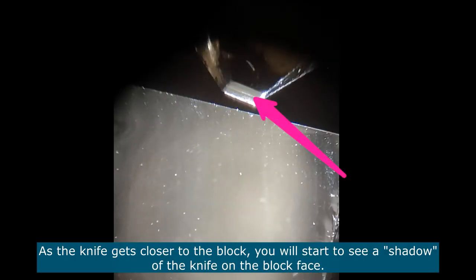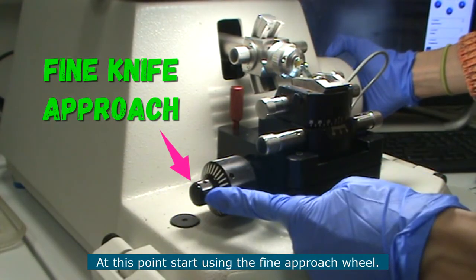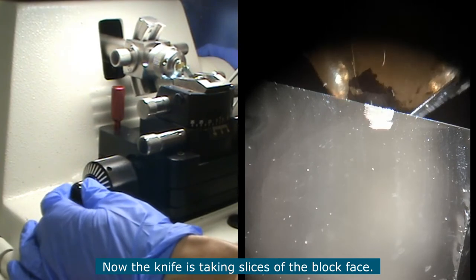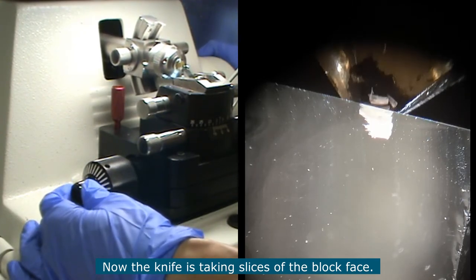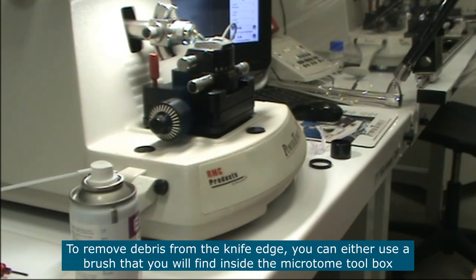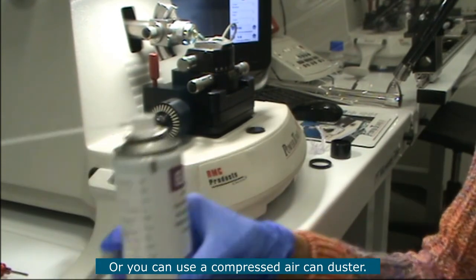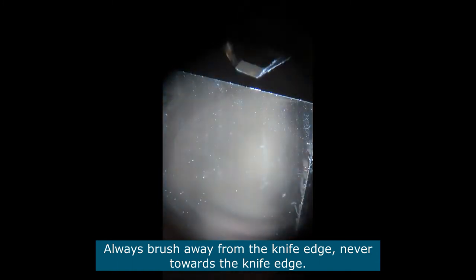As the knife gets close to the block, you will start to see a shadow of the knife on the block face. Now the knife got quite close to the block and it actually took a section of the block face. At this point start using the fine approach — you are now taking slices of the block face with your glass knife. To remove debris from the knife edge, you can either use a brush from the box of tools above the microtome, or use one of these compressed air canisters. Always brush away from the knife edge, never towards it.